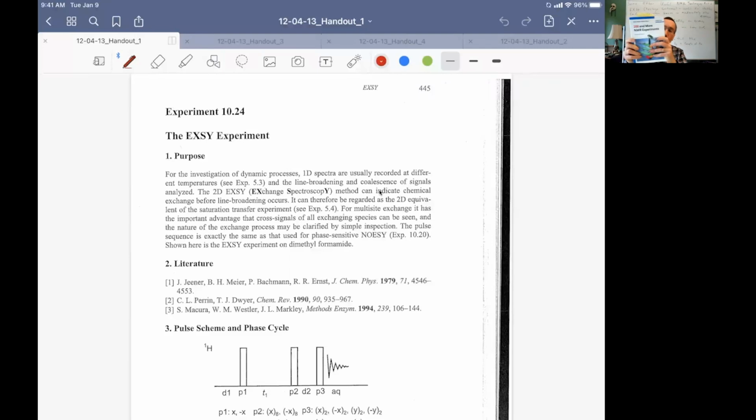I was saying what a nice book it was because it gives examples of lots of experiments. And then I mentioned this other book, which one of them published subsequently, 50 and More Essential NMR Experiments, which talks a little bit more about running the experiments, and both give operational examples of this.